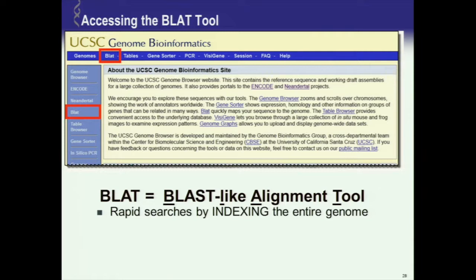So here's some information about BLAT. Basically, it's really fast because of the way that the genome is indexed, I believe, into 36-mers that it looks for a short match to. It kind of works like many of the high-throughput sequencing mapping algorithms. Unlike BLAST, it's basically tuned to only show you high-similarity matches, so you're not going to get a lot of spurious or lower homology hits. The other thing is it does have a minimum, so I believe anything less than 24 base pairs, you're not guaranteed to get a hit. Because of the way the genome is indexed into 36-mers, it depends how your 24-mer overlaps those 36-mer chunks the genome was indexed into, you may or may not get a hit. So it'll still often give you a hit for like 20-mers. Certainly I wouldn't use it for anything less than a 20-mer.